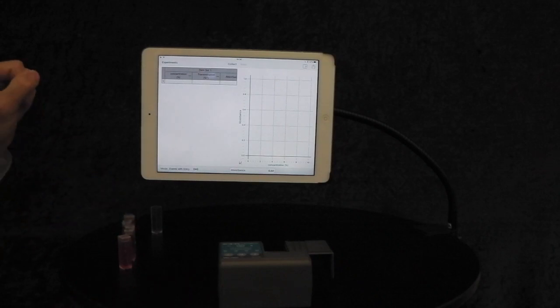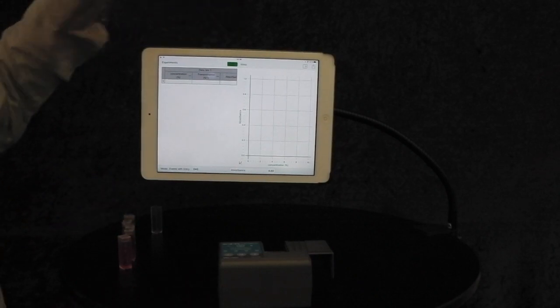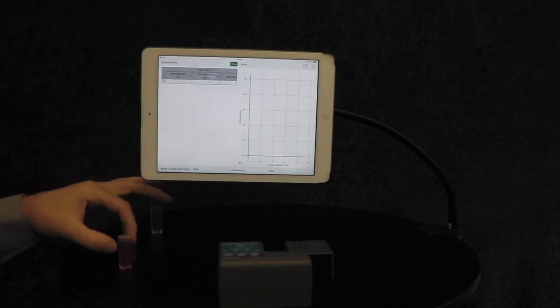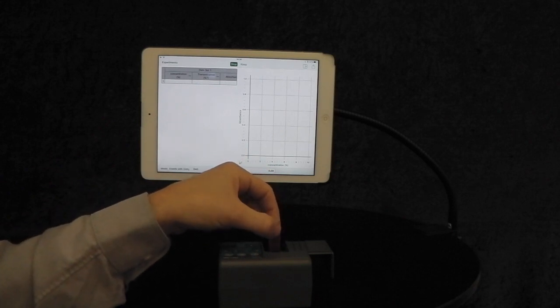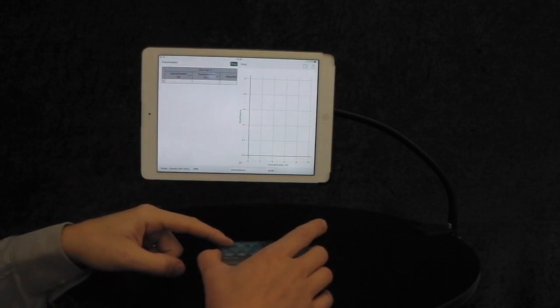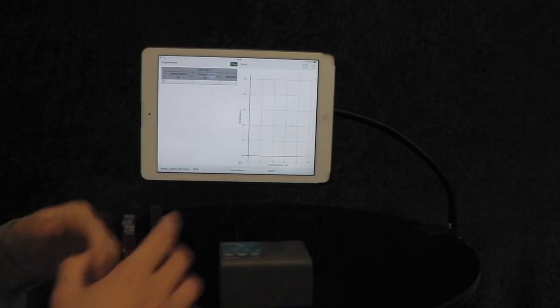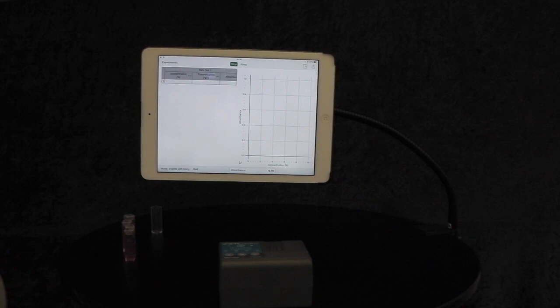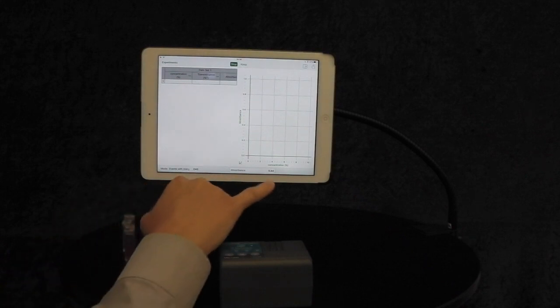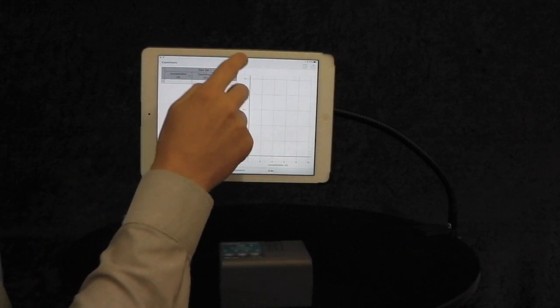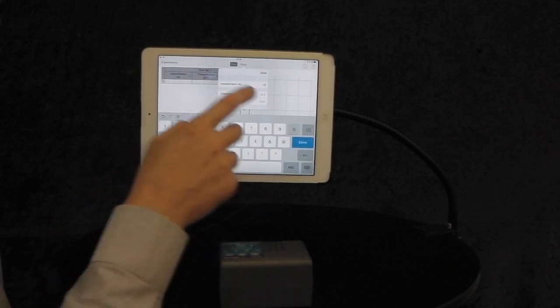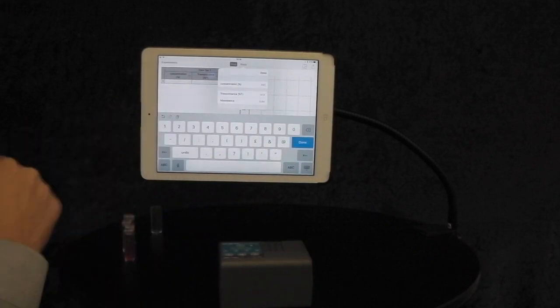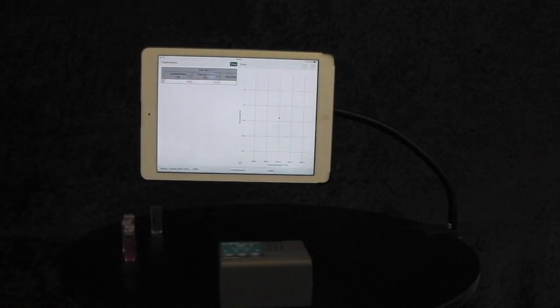I can now start my experiment. I'm going to click Collect and insert the 100% red solution. Close the lid of the colorimeter. Wait for the absorbance reading to settle. Once it's settled, press Keep. Type in the concentration, which is 100%. Click Done.